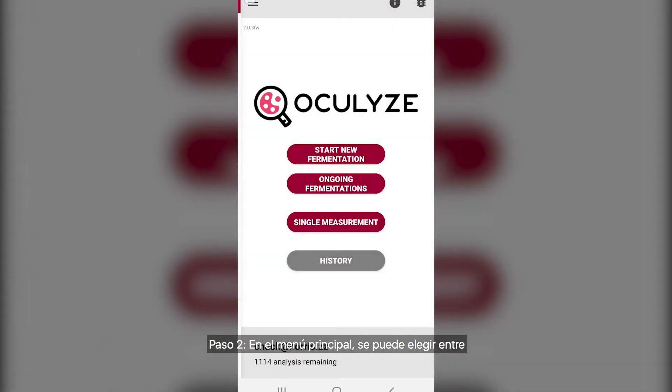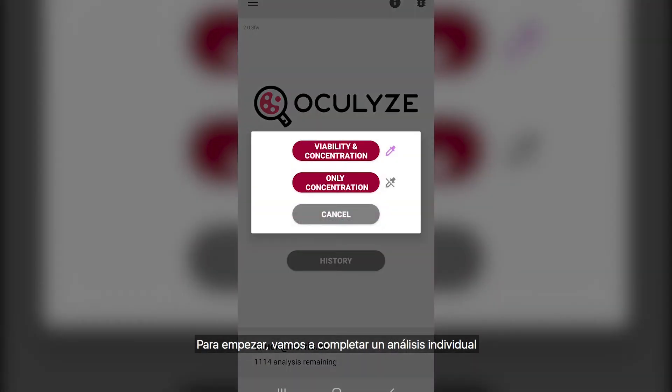Step 2: on the main menu you can choose to either start a new fermentation, continue an ongoing fermentation, complete a single measurement, or check your history. To begin, we're going to complete a single measurement. Step 3: here you can check your concentration or your concentration and viability. Since we have stained our sample with methylene violet, we will be checking our concentration and viability.